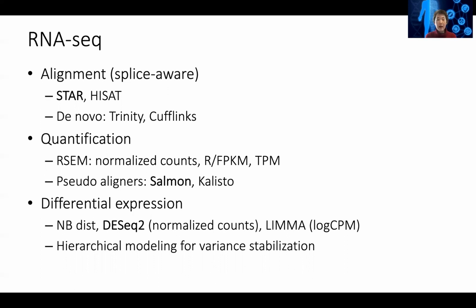If you only have limited samples, DE-seq, I would say, is probably the choice to go. But if you have, for example, very complicated experimental designs with many different conditions that you have to compare, or if you have many, many samples, you can use limma. And even if you have hundreds of samples for two conditions, these algorithms will actually give you very, very similar results.